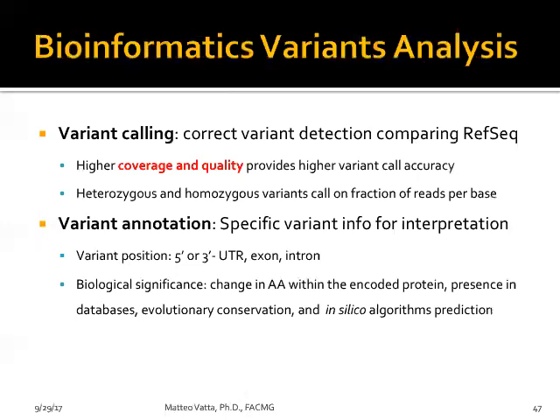So then of course, in addition to the variant calling, so having high quality, high coverage, and determining the zygosity, remember, not always, even for constitutional genetics, will you be lucky enough to find a 50-50 ratio between the variant, but everything that is close to it can be called confidently.